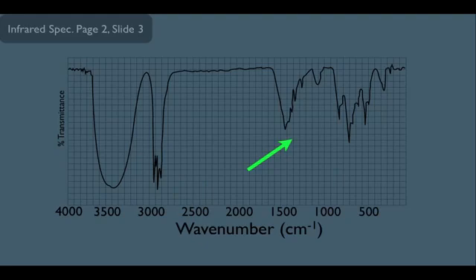But what I want to point out here is that in the actual IR spectrum, they don't put frequency on the x-axis, they put wave number instead. There's a good reason for this, but it's beyond this lecture at this point. Just know for now that there is a connection between frequency of light and wave number of light. And instead of thinking that absorption bands happen at certain frequencies, we can say absorption bands also happen at certain wave numbers.